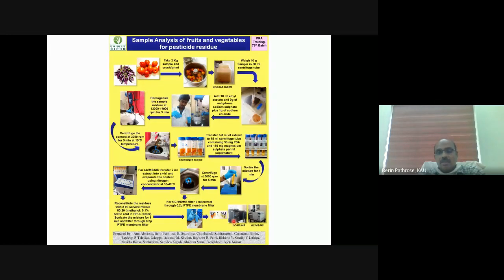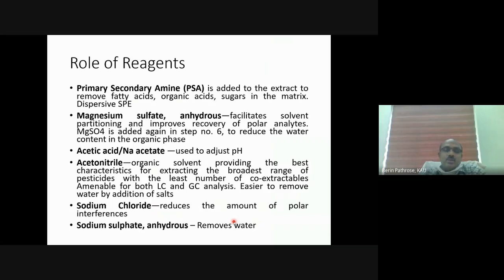Yes. Okay. Then one more thing. I told you we will be adding sodium sulfate, sodium chloride, magnesium sulfate, primary, secondary amine, and there is a certain role for each and every reagent. Primary, secondary amine (PSA) is nothing but, I will just say one thing.